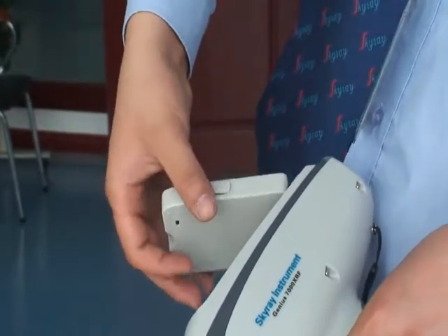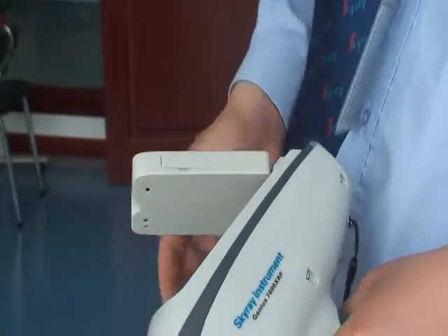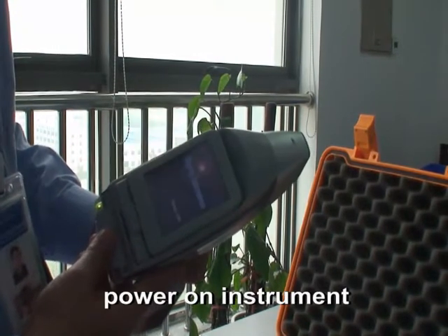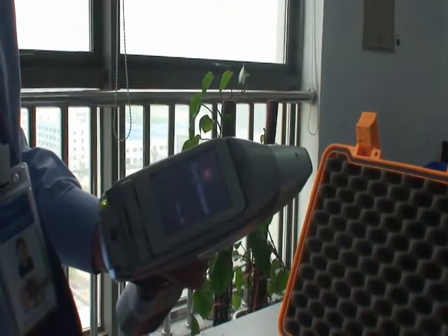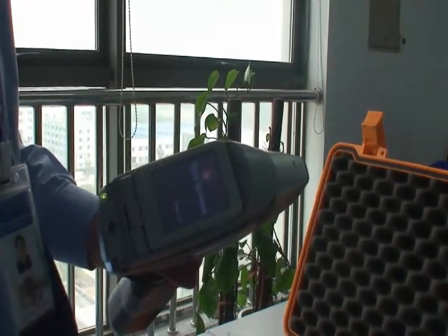Press the power button for 3–5 seconds to turn on the instrument; the software will load automatically. It will take about 1 minute to start the software, so please wait patiently. After starting the software, enter the password and press Enter.